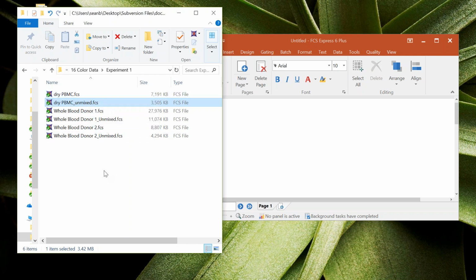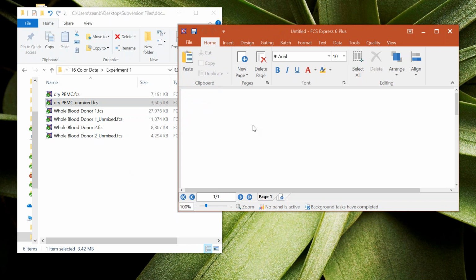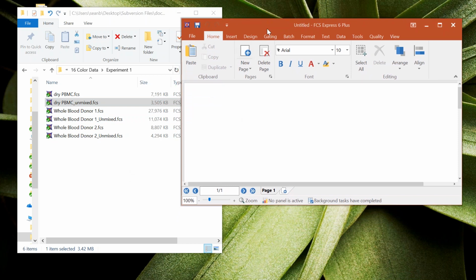Now, when you're working with spectral data files in FCS Express from Cytek, you need both of these data files, and as long as they're both contained within the same folder for your experiment, you can load it into FCS Express and have access to the raw spectral data and have access to the standard FCS file data at all times. And to load this data into FCS Express, you can see that we have version 6 here running on the right-hand side, the latest release that includes this ability to read these spectral data files from Cytek.